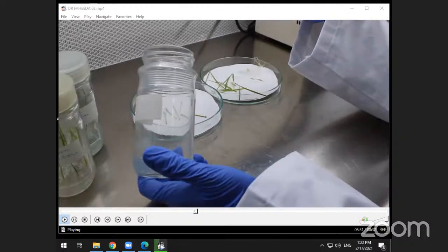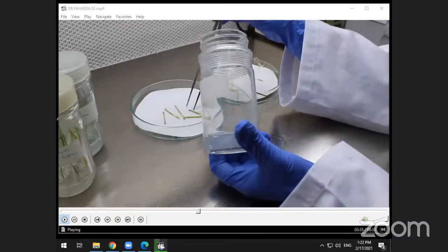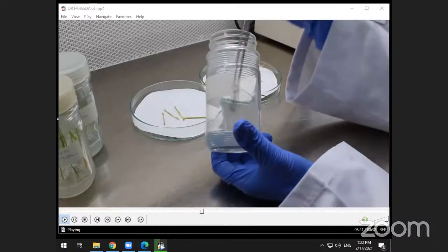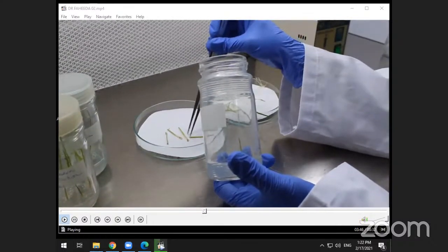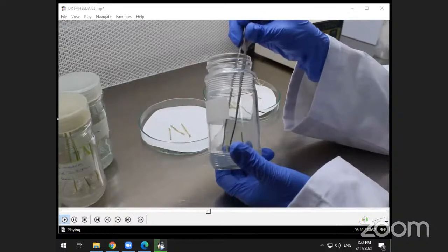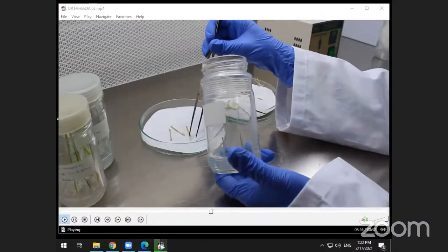Once the dried dead parts have been removed, inoculate the plants into the fresh media with cytokinins. Avoid touching the walls of the jars to avoid contamination, and do not use hot forceps as it can damage your plant.